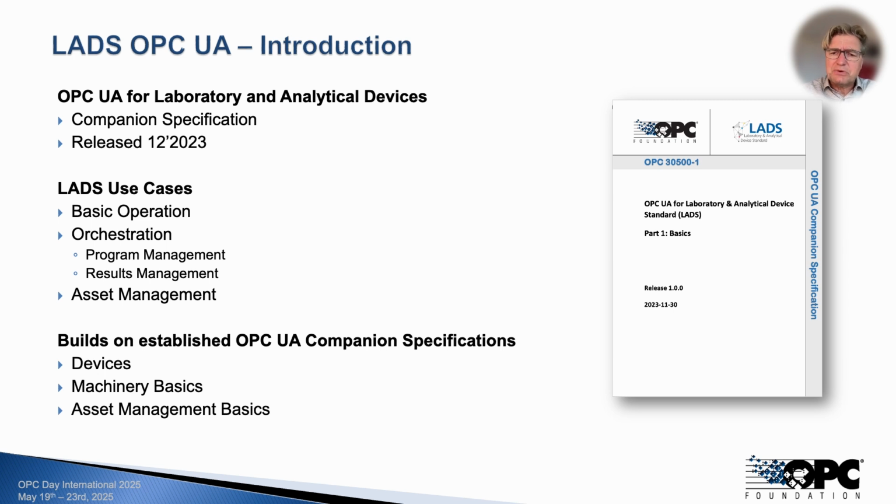LADS builds directly on well-established companion specifications. Devices, the foundation of every device-specific companion specification. Machinery basics, enabling Industry 4.0 compliant integration. And asset management basics, to align with broader OPC UA asset strategies. So, LADS doesn't reinvent the wheel, it extends proven OPC UA models to fit the specific requirements of the lab and analytical world.